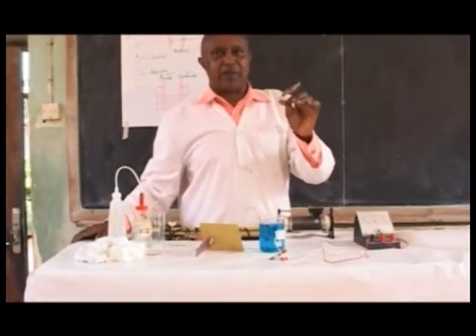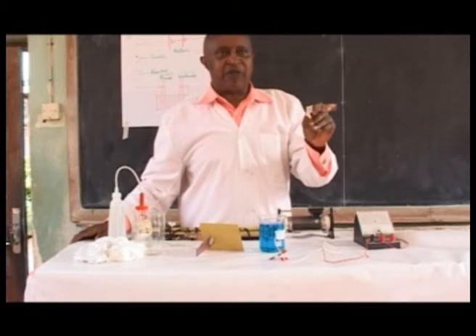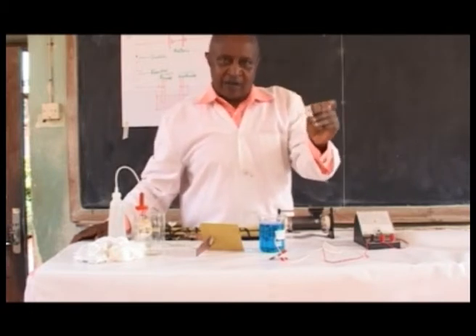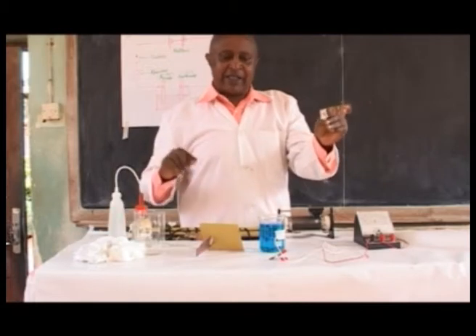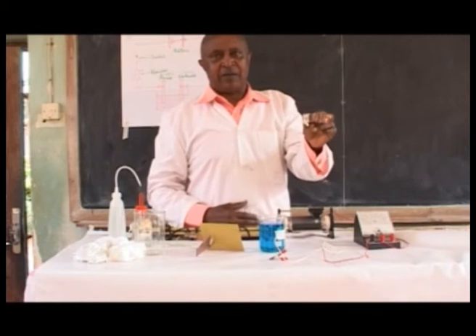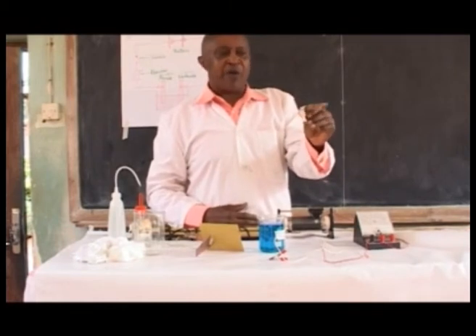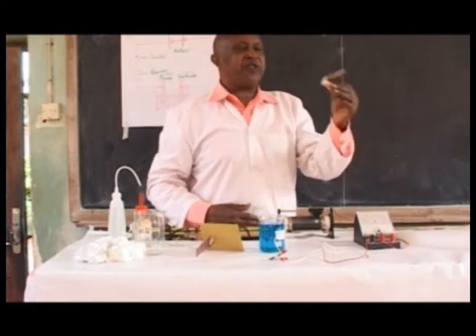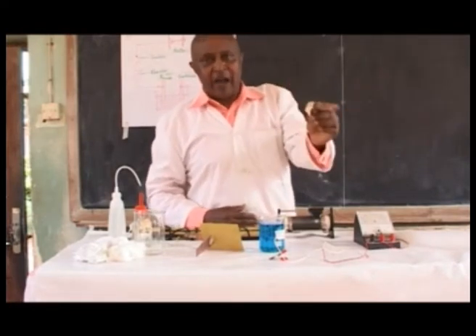In this experiment, observe the corrosion of the anode as electricity passes through the electrolyte, which means now you have to take the first reading of the mass of the anode.